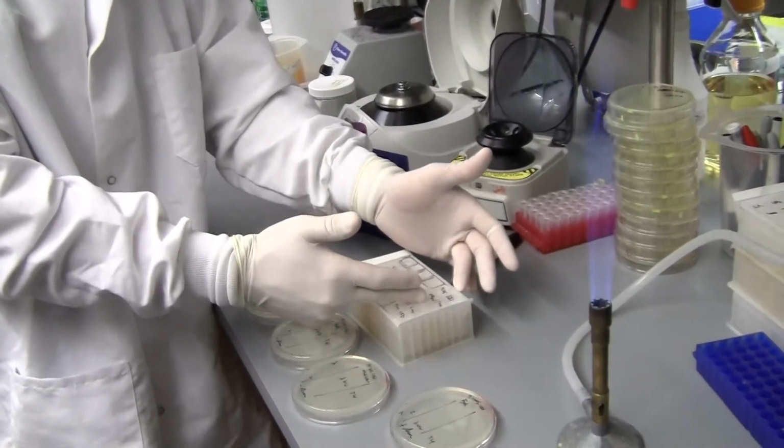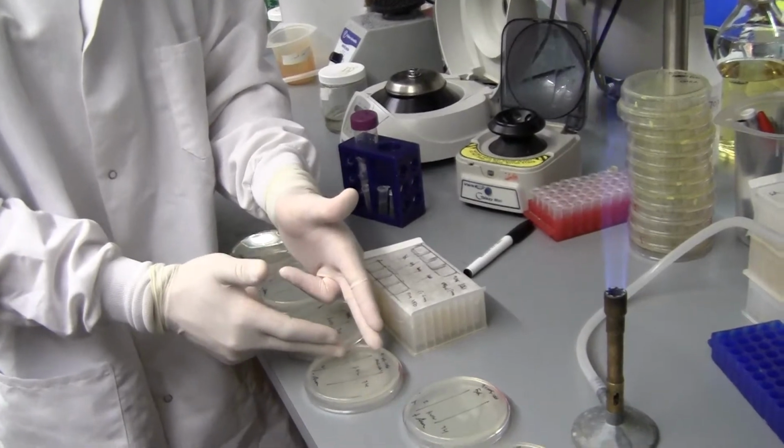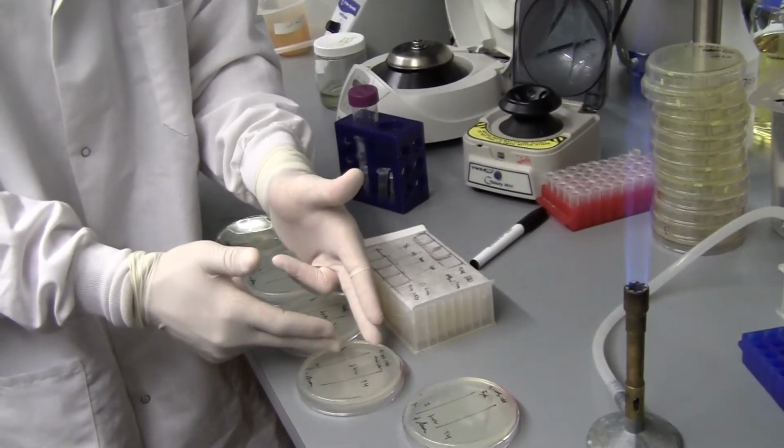Hopefully we'll see that when we have induced the expression of our IM gene, we get a slight protection. That means that we have phage clearing to a lower level. But when I do not induce, there's no protection and the phage will kill every single one of those bacteria, which means that our serial dilution will go out a lot farther. So at the end of this video, we'll see what that looks like.